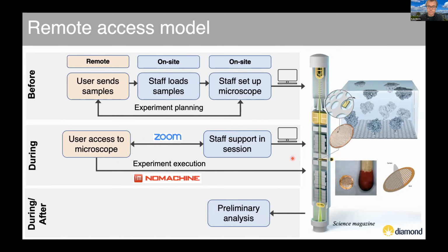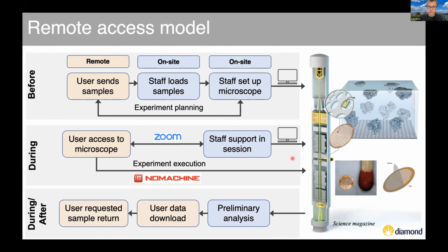After the session, the user can download their data, which has already had some analysis done on it automatically, and request their samples to be returned.